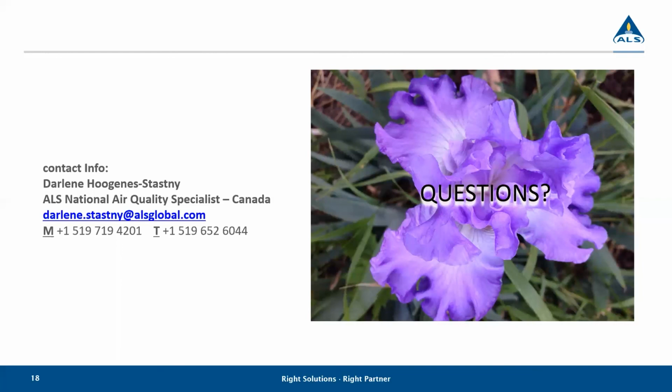We're not inflexible. If you're supposed to pick up the samples on Friday the 24th and you don't pick them up until Monday the 27th, make note of it and state that you picked them up on Monday the 27th. If you're going to keep them 1 or 2 extra days, we're usually fairly flexible. At this point in time, we start calling for the canisters back if they've been in your possession for close to 3 weeks. So we're not hard and fast on that 2-week period.